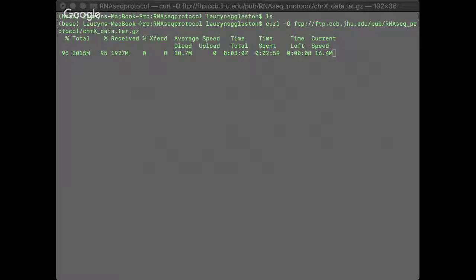Okay, so it's almost done unpacking. Yay, went way faster. Okay, so what you'll need to do is get back over here.